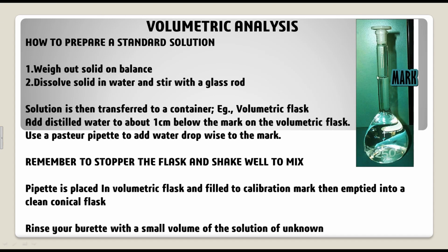You can see here. Next, use a pipette to add water dropwise up to the mark. This is the way you have to calibrate this volumetric flask. Before adding this solution into this volumetric flask, don't forget to use the stopper on the volumetric flask.